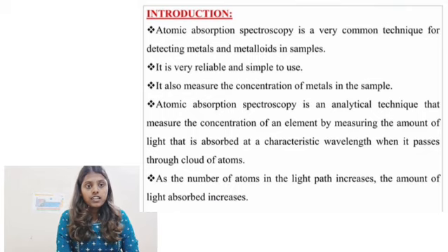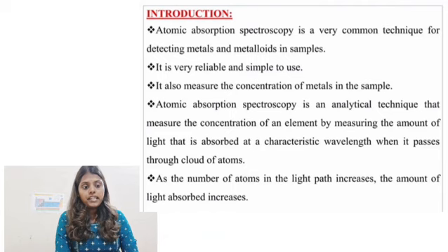This method is used for the qualitative and quantitative determination of more than 70 elements in the periodic table. It is a spectroscopic method which is very rapid and highly selective, and it is very convenient.